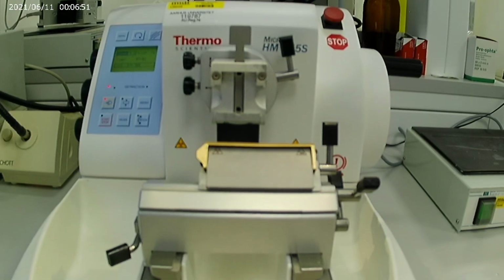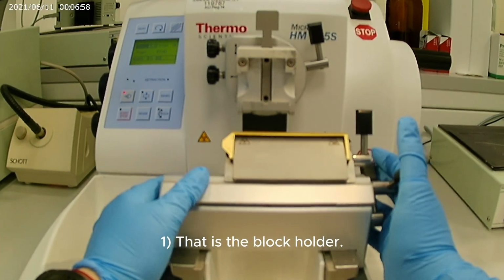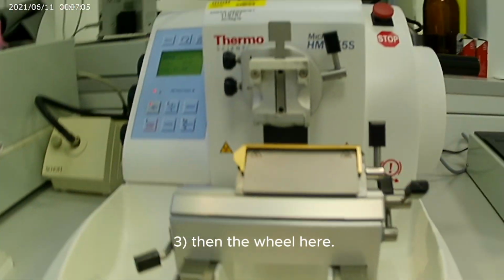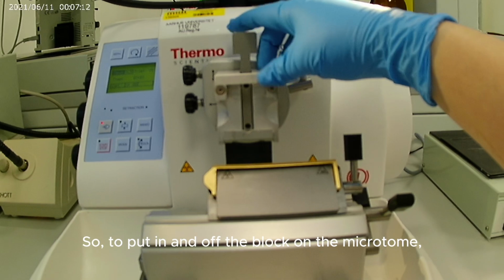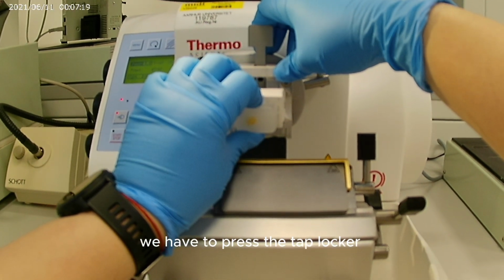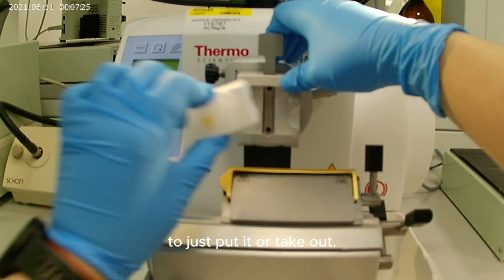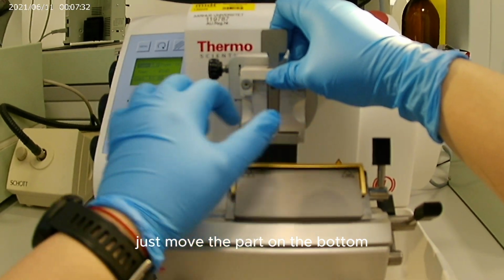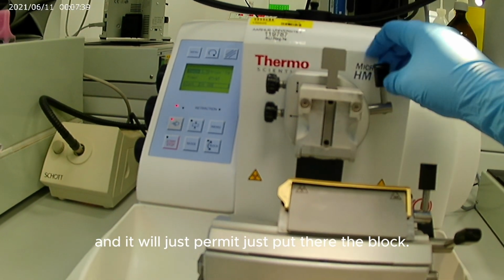So what I'm gonna start to explain is this part that is the block holder. This is the second, the blade holder, and then the wheel here. So to put the block in and take it off the microtome, we have to press the tab locker, to just put it in or take it out. The tab locker is gonna just move the part on the bottom, and it will permit you to put the block.